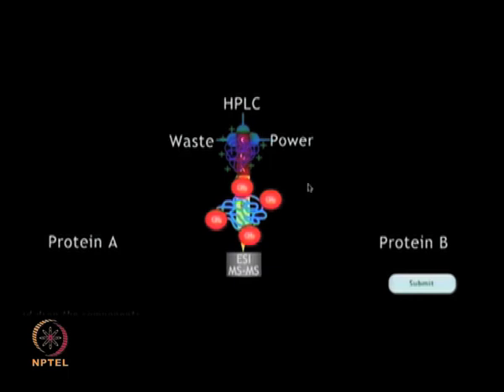You can use the protein properties and separate those in the multidimensional protein identification technology. MudPIT is a non-gel technique to separate and identify individual components of complex protein and peptide mixtures of a proteome.